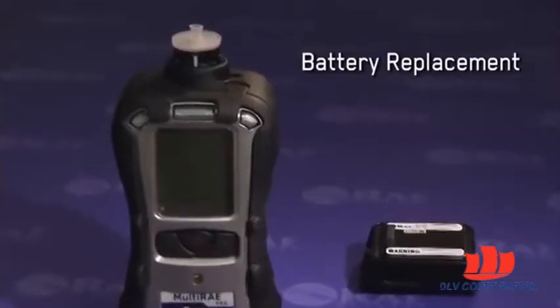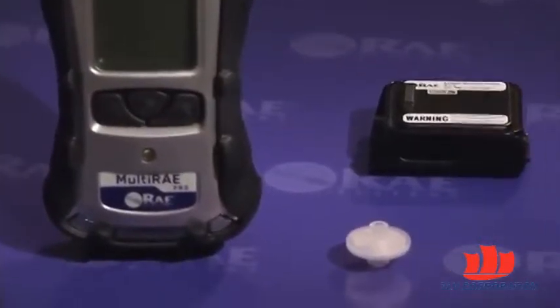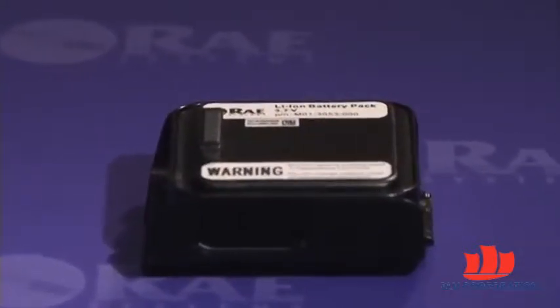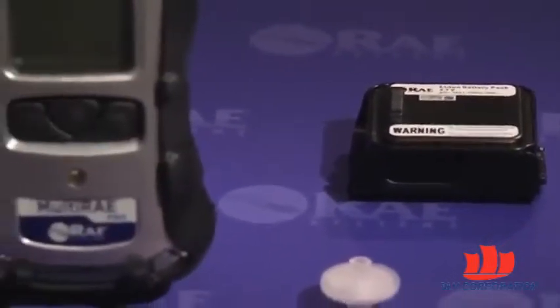The new multi-array has been engineered for easy maintenance in the field, so its battery and filter are plug and play and their replacement requires no tools. Whether you're using a standard lithium-ion battery, an extended duration battery, or an alkaline battery pack, the battery replacement process takes three easy steps.